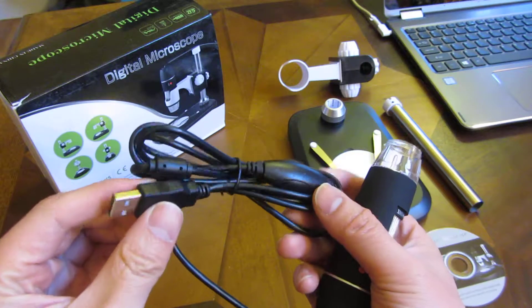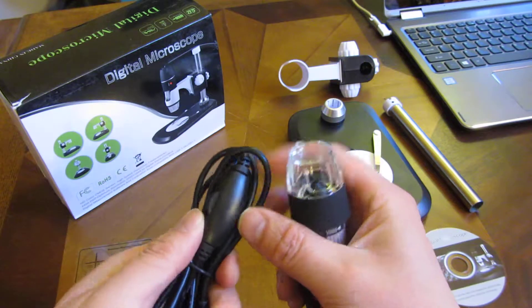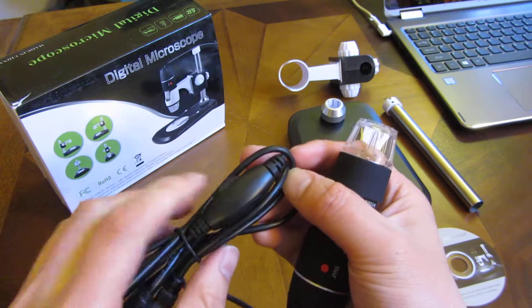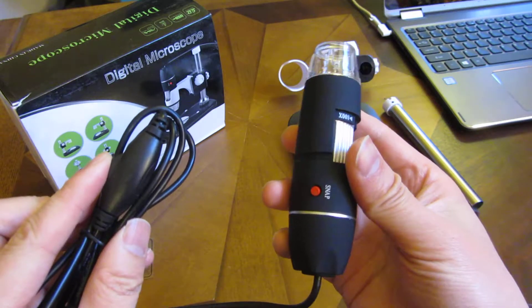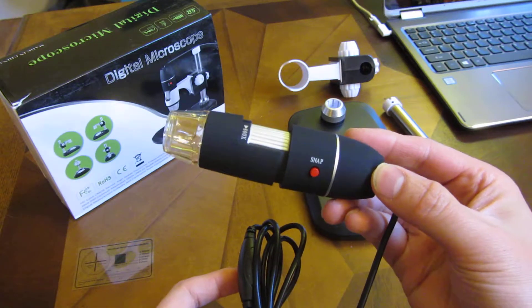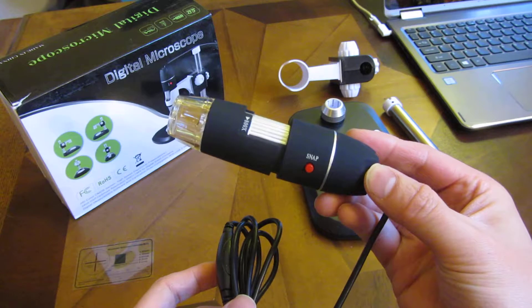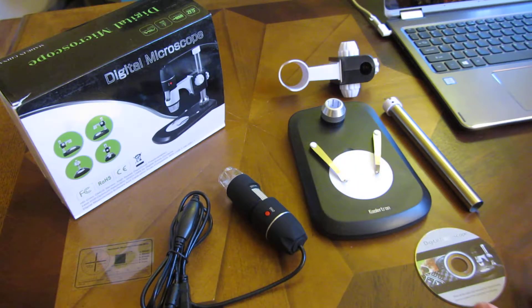It comes with a USB camera with LED light brightness adjustments. I can scroll here and adjust the brightness of the camera itself. The camera also comes with a button to take a snapshot picture, and I will show you that later after I've assembled this.